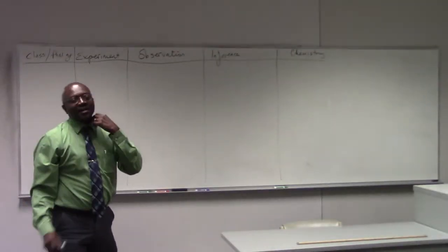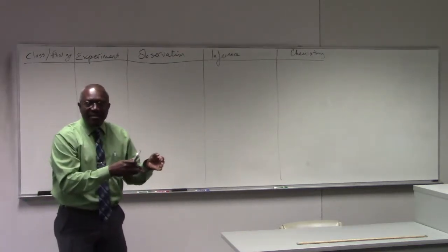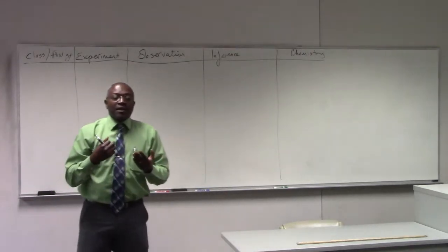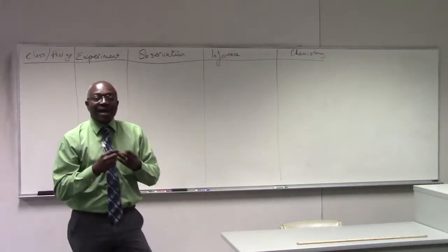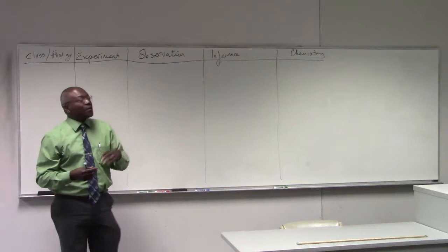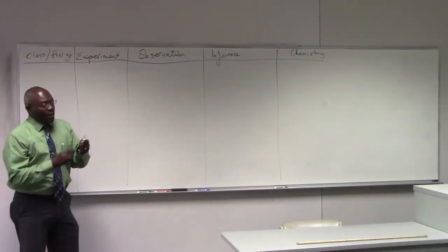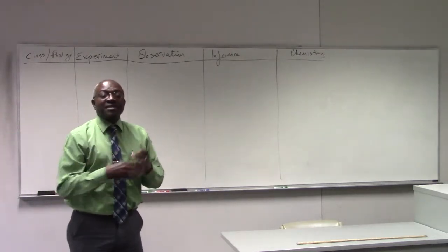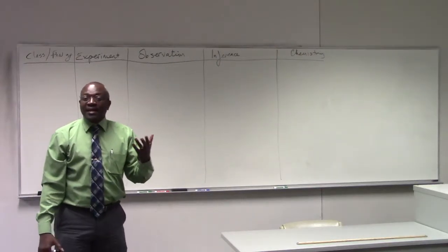Okay, so we don't do reactions on alkanes, right? I should phrase that: there are no wet chemical tests for alkanes. And the reason is alkanes only undergo, as far as we're concerned, two reactions. They burn, and they also react with halogen and light. But that reaction is very, very slow, and that's not something that we actually will do as a wet chemical test. In fact, the way you would probably identify an alkane through wet chemistry is that it's a compound that gives none of the other reactions. And if it gives none of the other reactions, that compound is going to be an alkane.